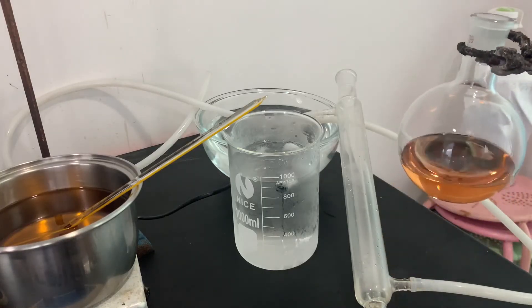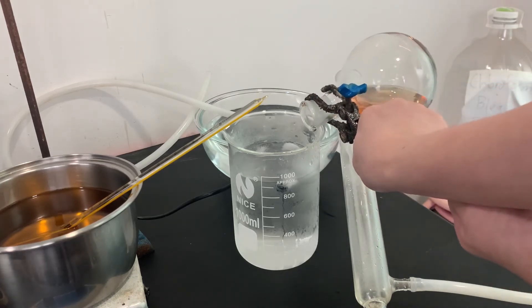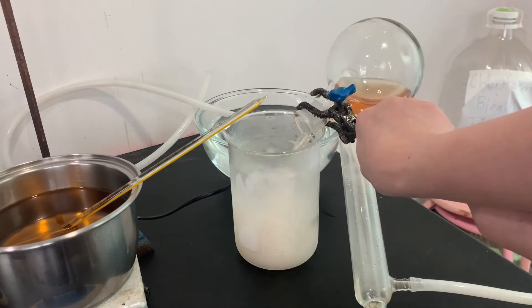After the reflux, I poured the contents of the flask into 1 liter of cold water while it is still hot. This will immediately precipitate out the acetanilide.